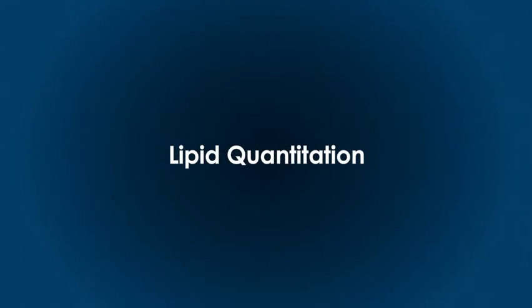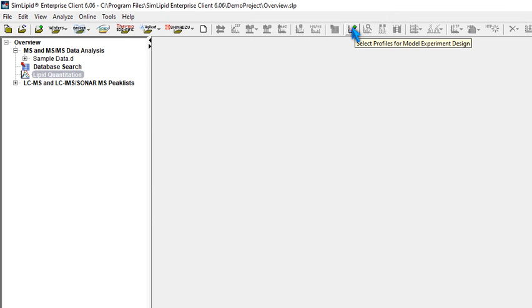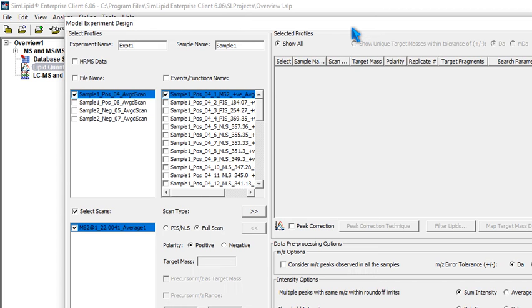Lipid quantitation. To perform lipid quantitation, you will need to switch to the Lipid Quantitation module.